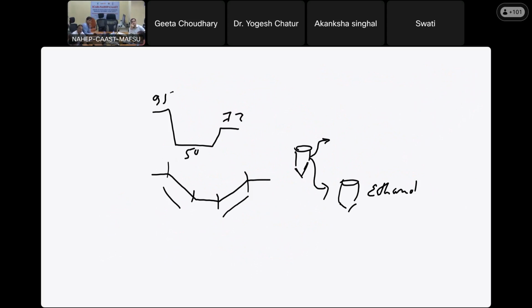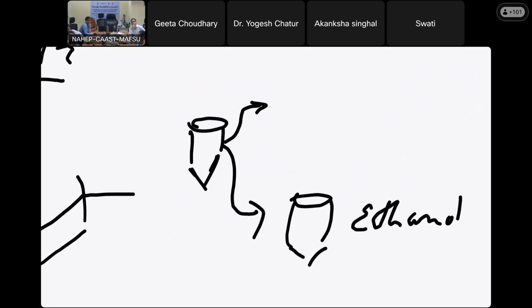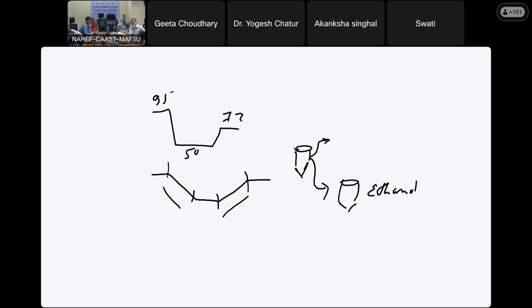That is why I would have to give a 2 to 3 hour lecture on sequencer parameters. Oh, sir. Yeah, those parameters I can tell you. It has temperature, voltage, current. All you have to set: the temperature of the inside furnace, we say. Then the time of the electrophoresis, pre-voltage, post-voltage.